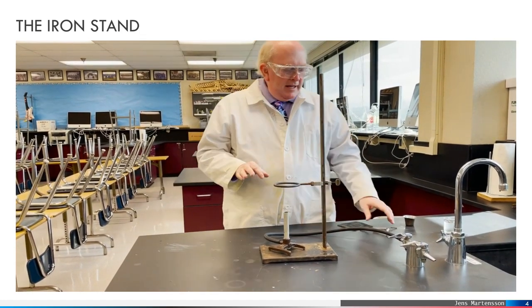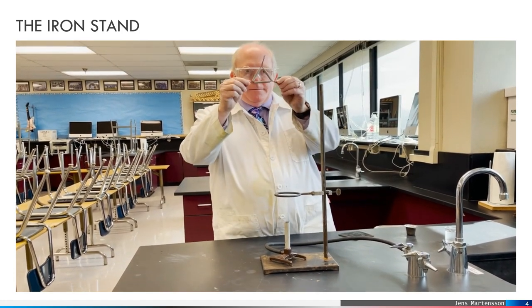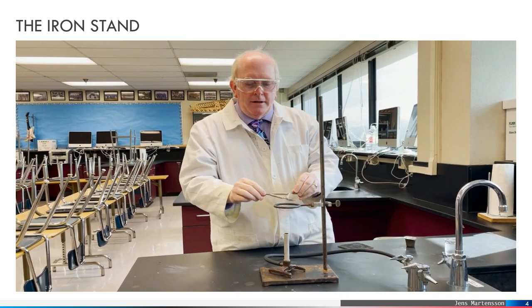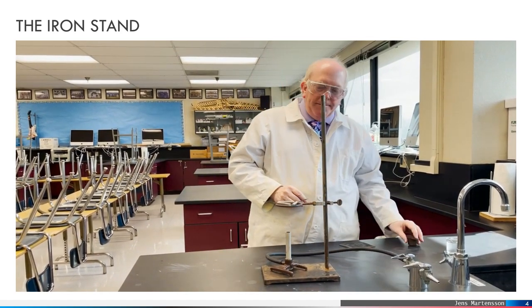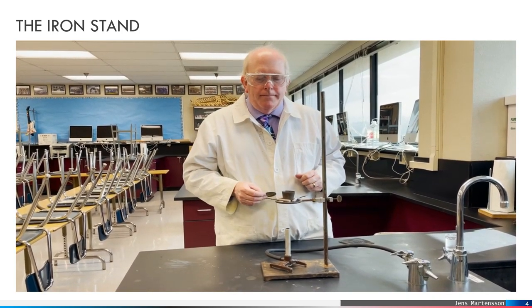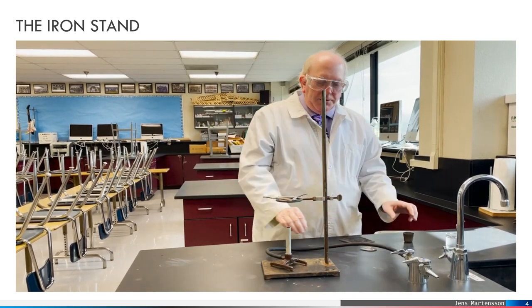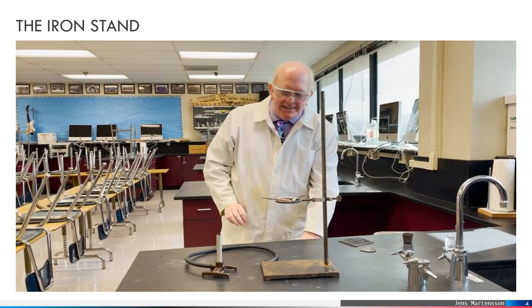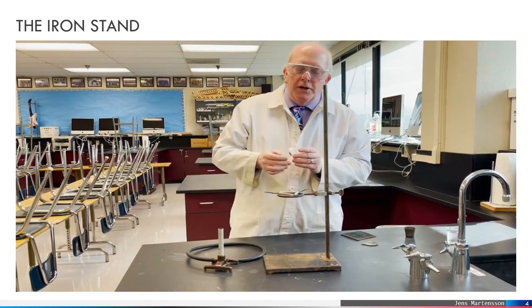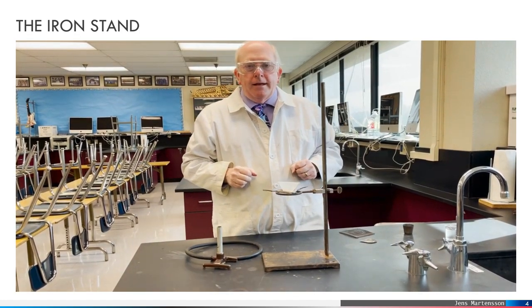The ring itself is good for holding something like a pipe stem triangle, with some nice pieces here that do not burn. We put them in place and that is designed for holding a crucible. If you are not using the Bunsen burner, you can use the pipe stem triangle to hold a funnel and use that for filtration.